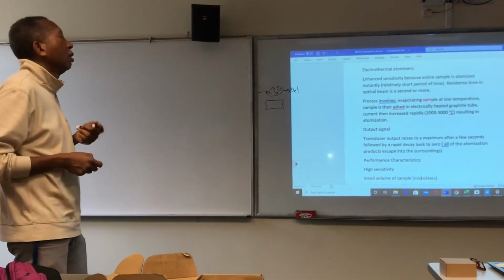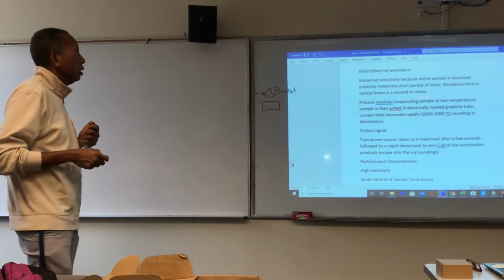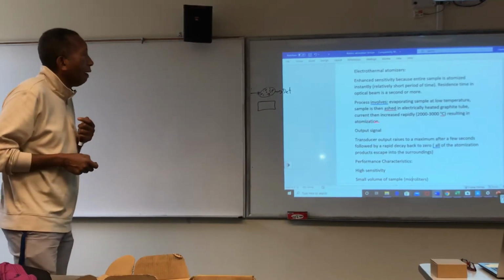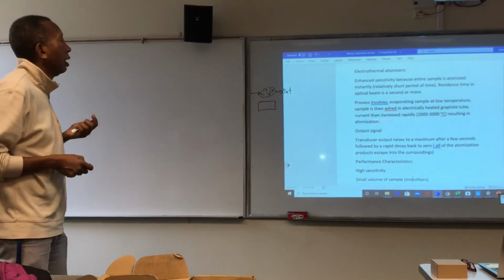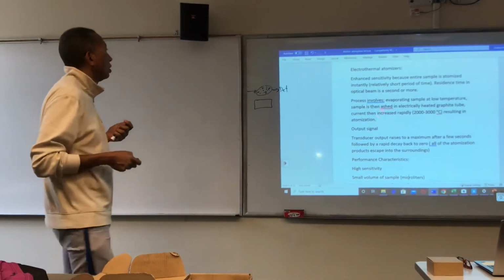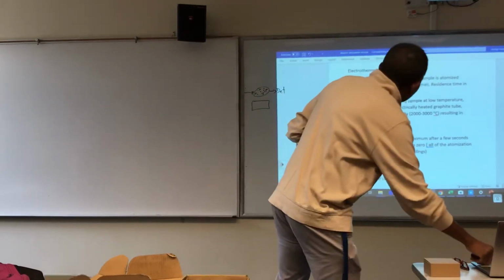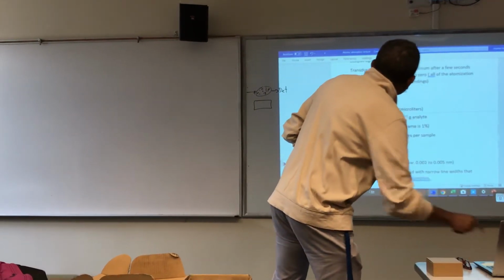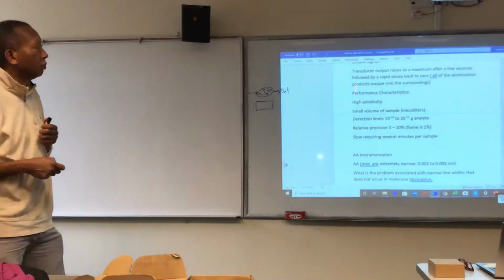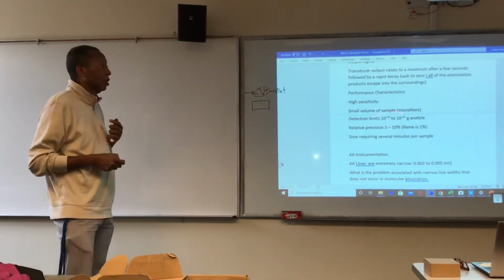And what we do, we evaporate the sample, we ash it electrically in some heated graphite tube that we showed before with a current, and we get atomization. This is a reminder to think about what the output signal is, and we know what the output signal is because I just answered that question for you. Again, performance characteristics: high sensitivity. We know that. We use a small amount of sample. Look at the detection limits.